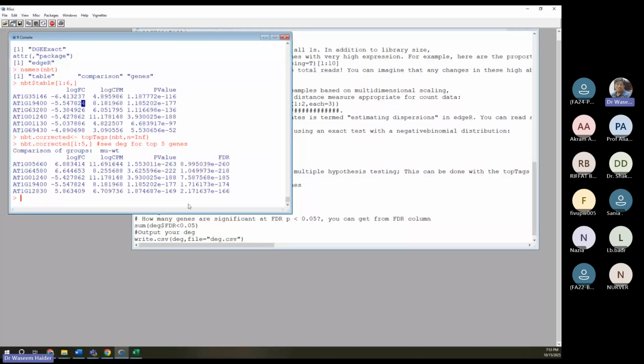Why are we doing that? Because this thing we introduced here is called the multiplicity problem, the multiple test problem, right? You are setting up so many experiments, throwing 6,000 tests, 6,000 rows. So the false positive rate or false discovery rate increases. So here we do that FDR correction, right, to minimize the false discovery rate. So that p-value that was 10 power minus 263 has now been raised a little bit higher to 10 power minus 260. Obviously, these are fractions and very small numbers, but something close to 0.05.